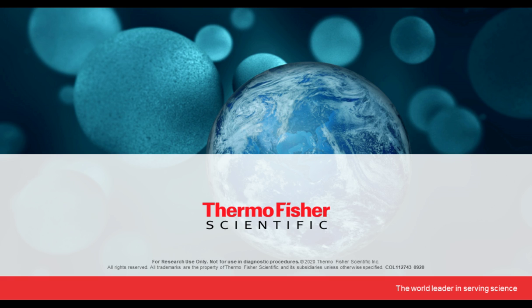Thank you. Okay, your next question, Alok: does the intensity of no-stain protein labeling reagent change only with the protein load, or are there other factors that can influence this as well? Great question. The signal that you get from no-stain labeling is really proportional to the protein load.